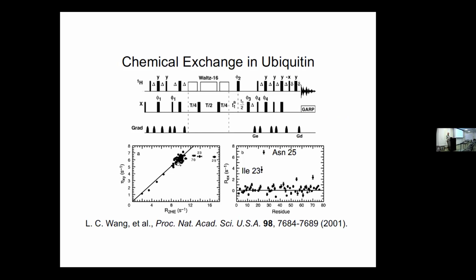You might hope that the line looked better than having this little blob, but some of that is due to the variation in the chemical shift anisotropy from residue to residue, which is quite difficult to characterize in solution NMR. So this is basically assuming an average chemical shift anisotropy.